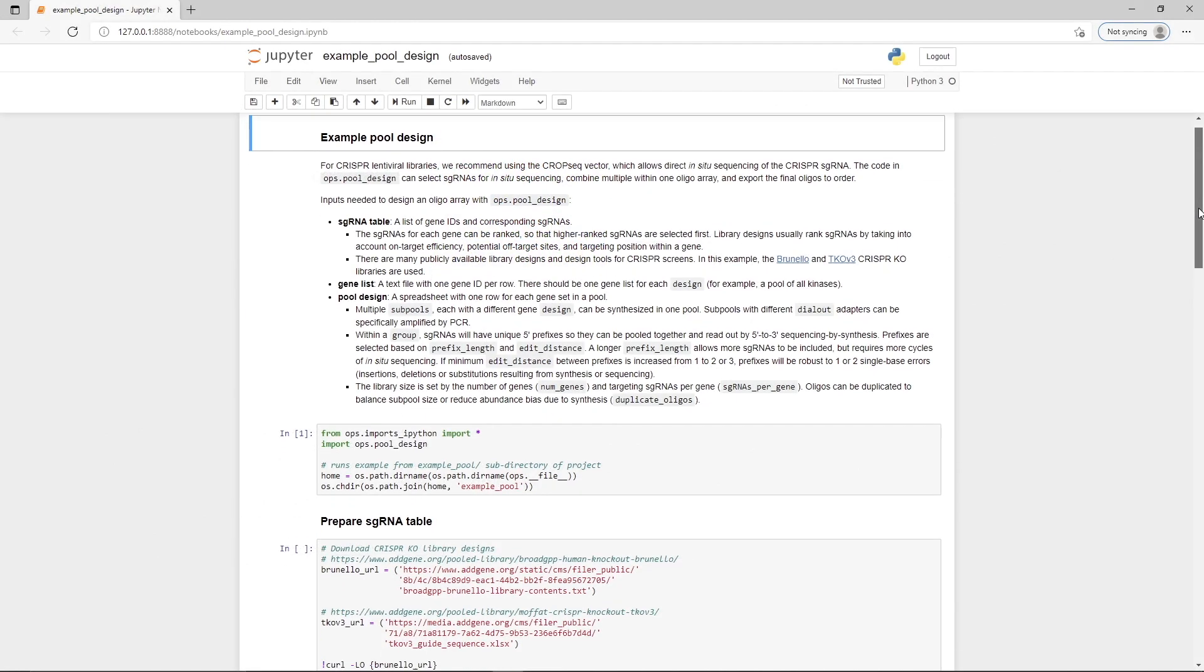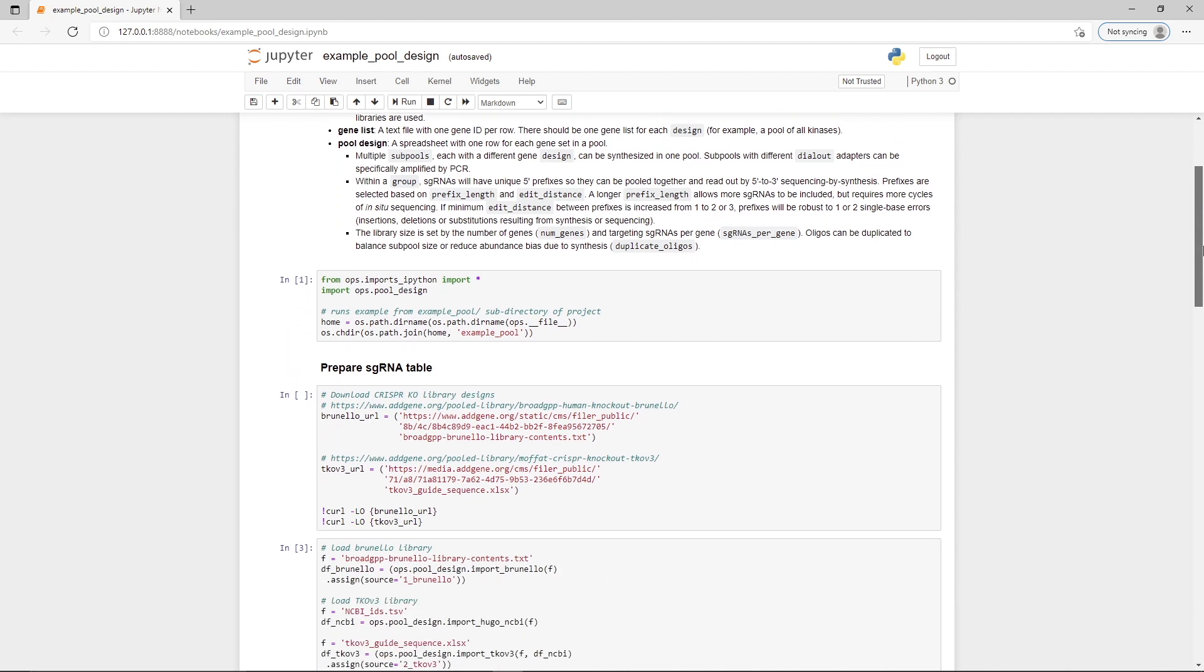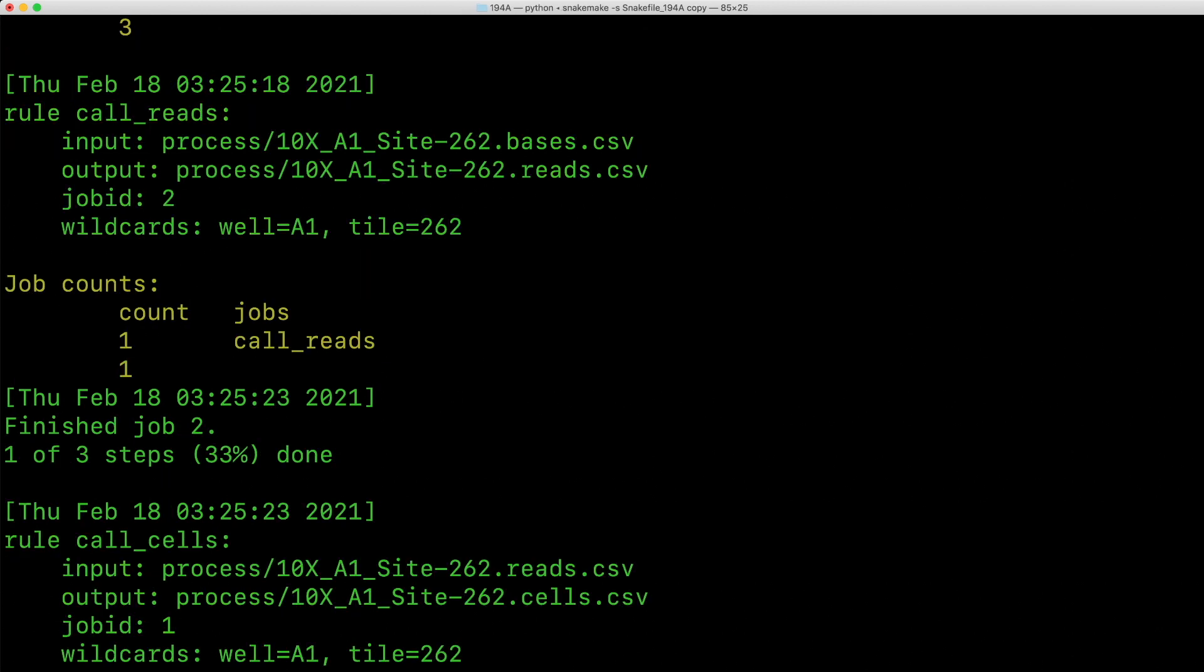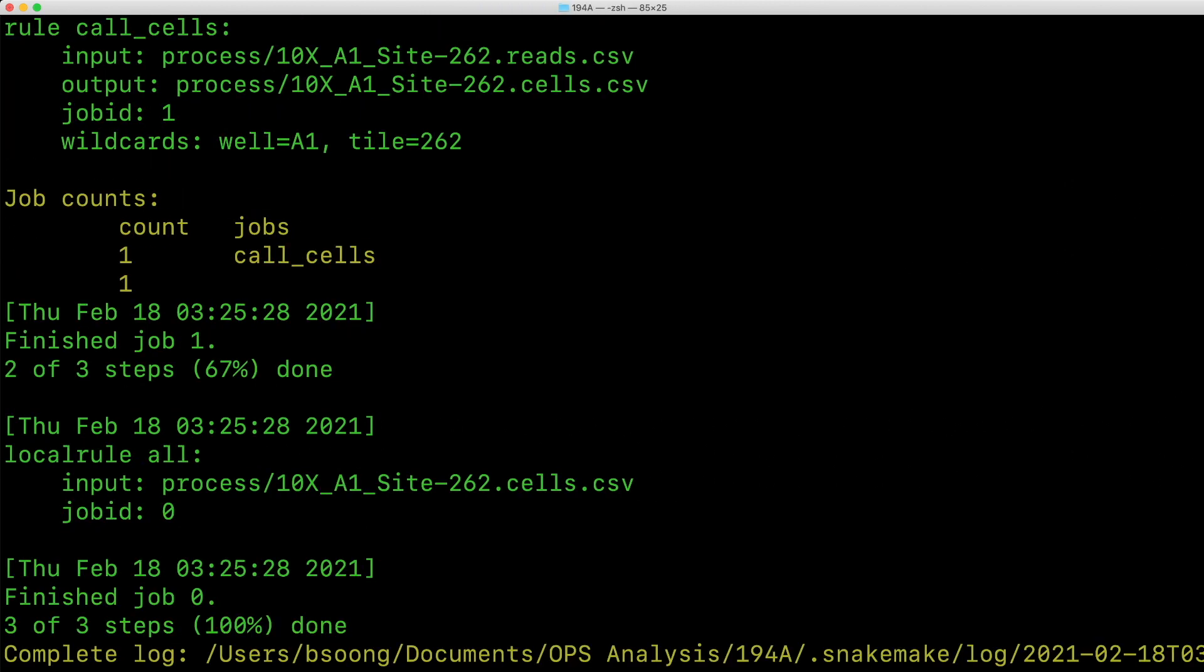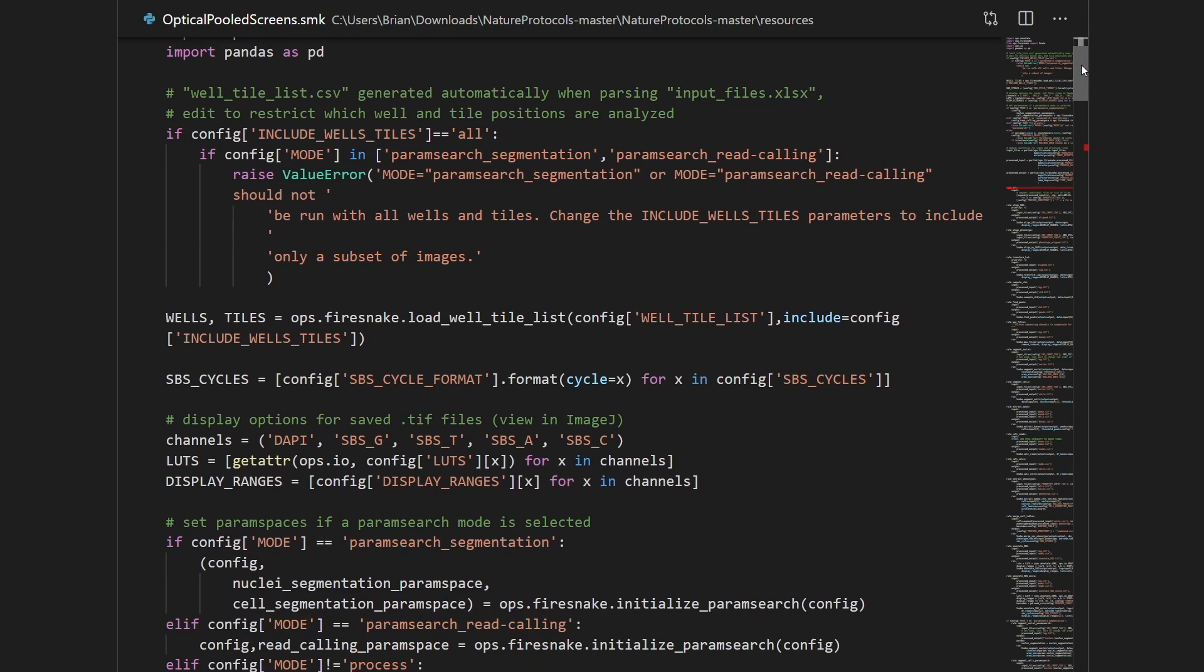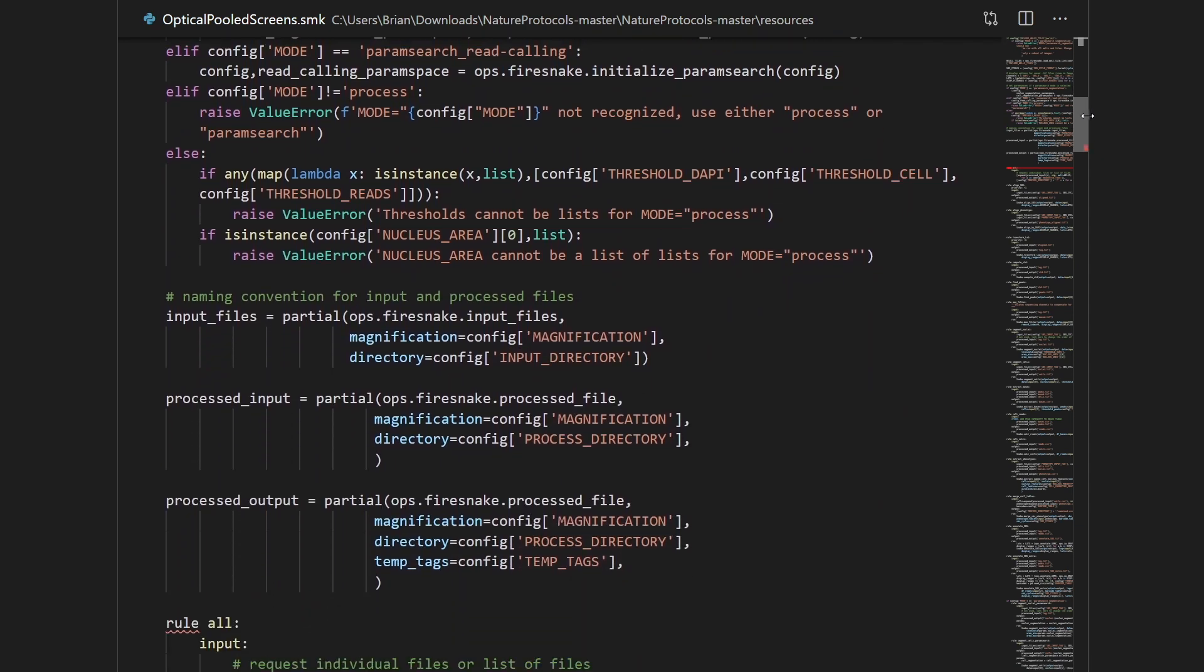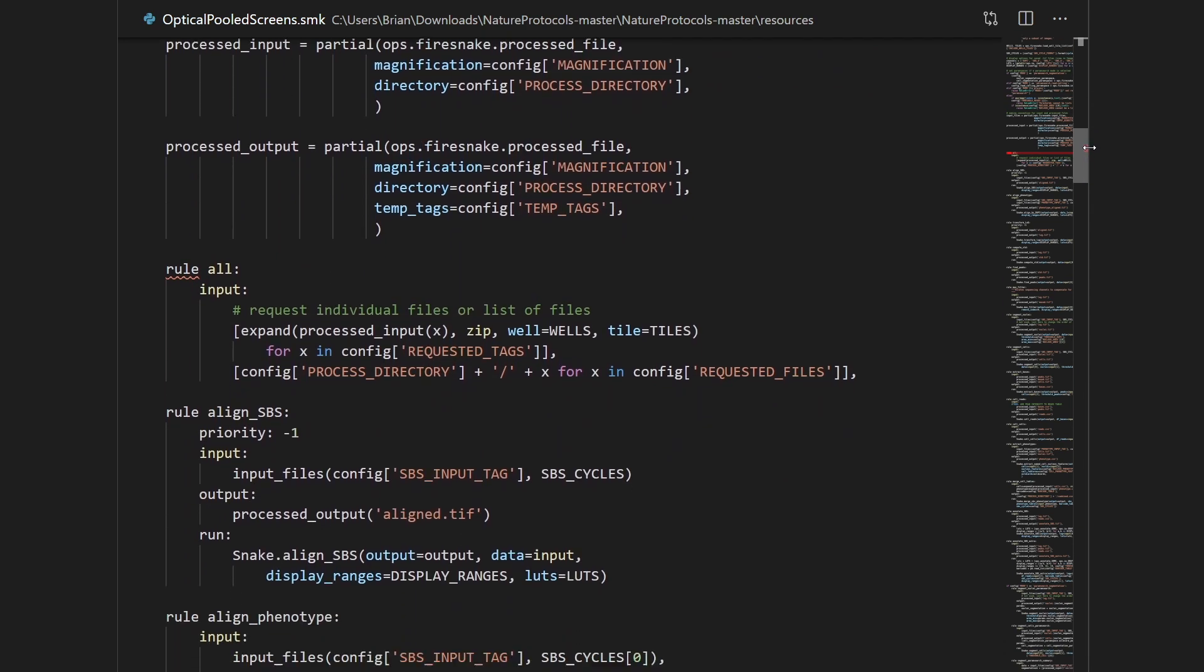An example Jupyter Notebook is provided to demonstrate the core functionality of the Python package. To scale this analysis for large datasets, it is recommended to process individual fields of view in parallel using the SnakeMake workflow management system. An example SnakeMake workflow is also supplied and can be flexibly deployed on a local computer, cloud-based virtual machine, or a compute cluster.